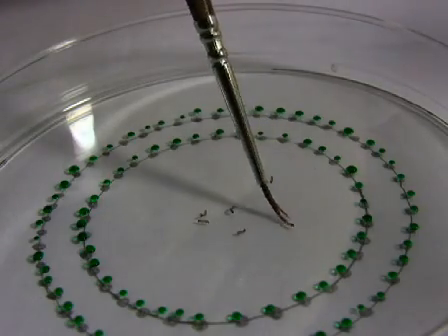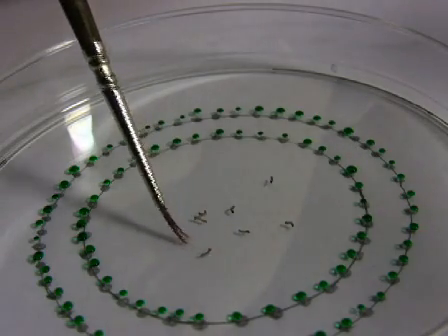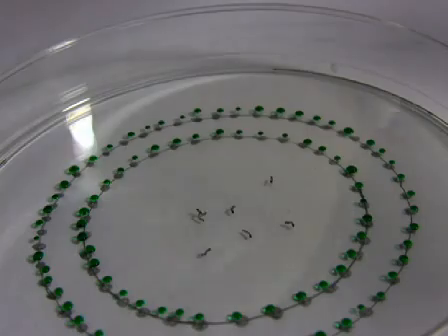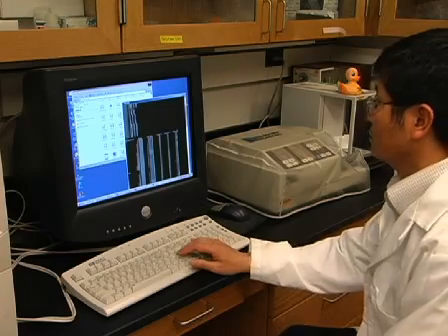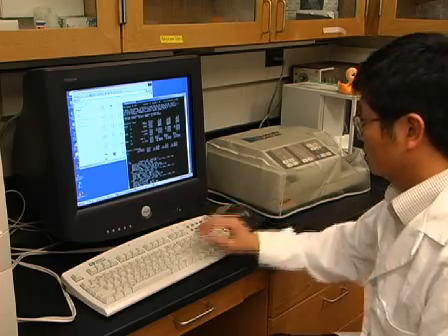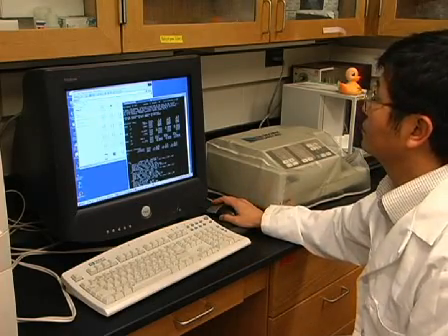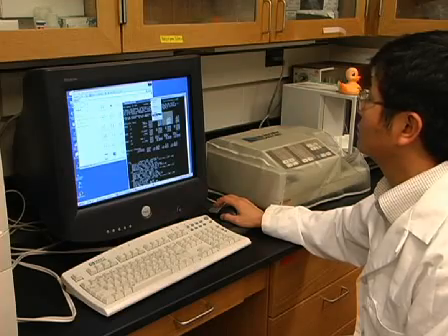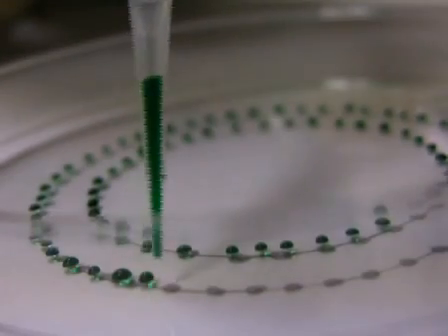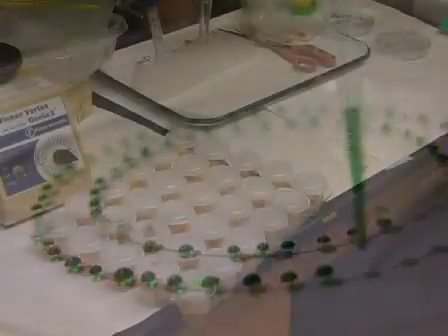Lethal concentration bioassays should be replicated 3 or 4 times on separate occasions. Use 30 individuals per dose for each virus or control treatment. Use an appropriate probit analysis program such as POLO or SAS to calculate LC50 values, 95% confidence intervals, and the appropriate statistics. This droplet feeding assay can also be used to determine ST50 survival time values.